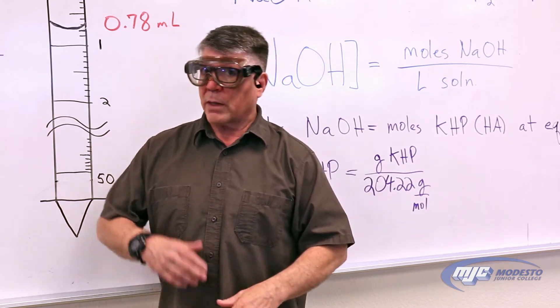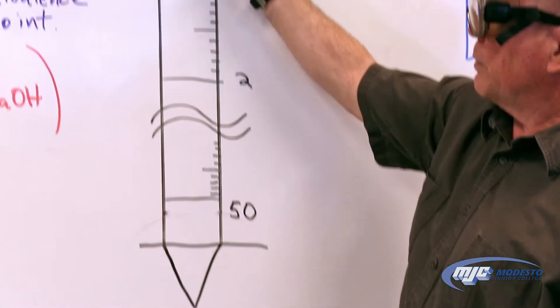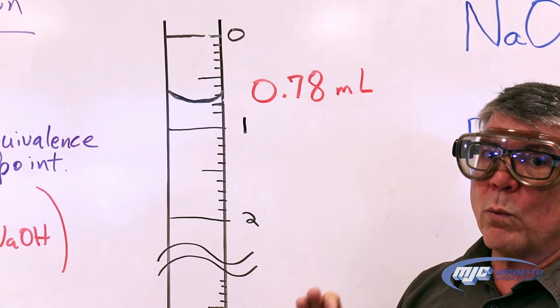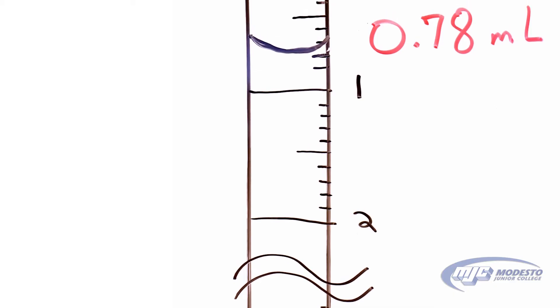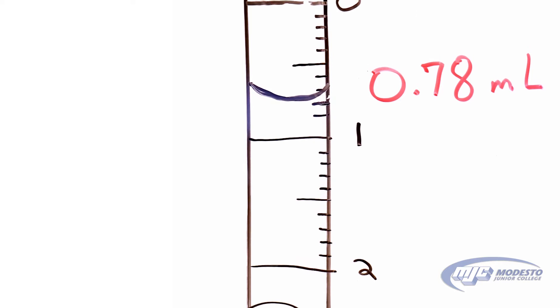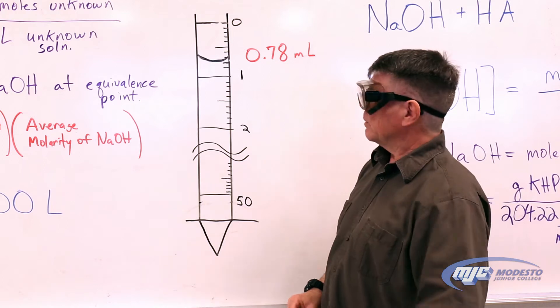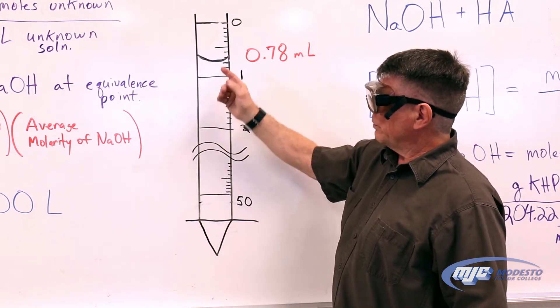Let's talk about how to read a burette. The first thing to remember is that zero is at the top — not the very top of the burette, but the zero mark is towards the top. Because we're using a 50 mL burette, the 50 is at the bottom. The closest marks are 0.1 milliliters apart, which means we need to record any volume we read from this instrument to two places past the decimal. We also read the bottom of the meniscus.